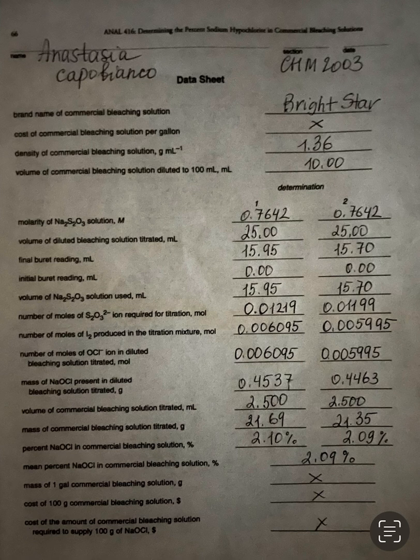Volume of diluted bleaching solution titrated. How much of that diluted bleaching solution from the volumetric flask did you add into the Erlenmeyer flask to start the titration process? You didn't use 10 or 100, right? You took 25 milliliters of that diluted solution from your volumetric flask, and you put it in 2 Erlenmeyer flasks.